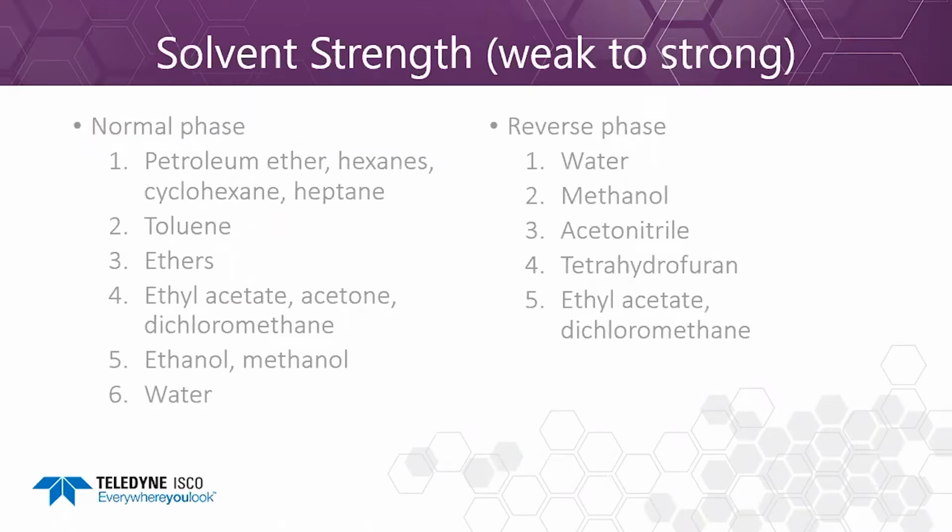Note the polarity order and see how it changes for normal and reverse phase in these two lists. In both cases, the strong solvents are at the bottom. This information is important in determining what solvents to use after extraction.